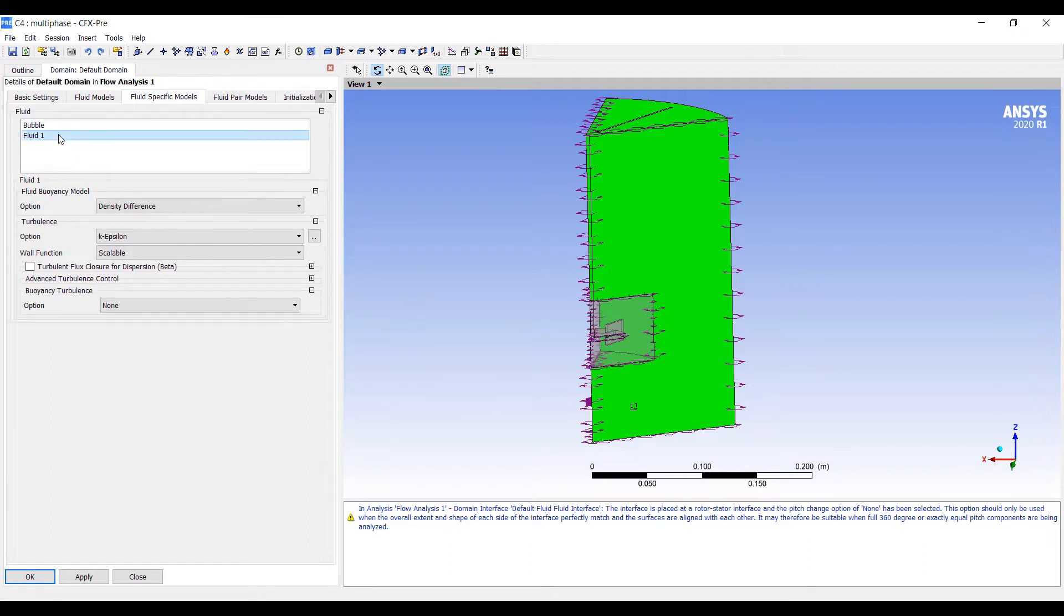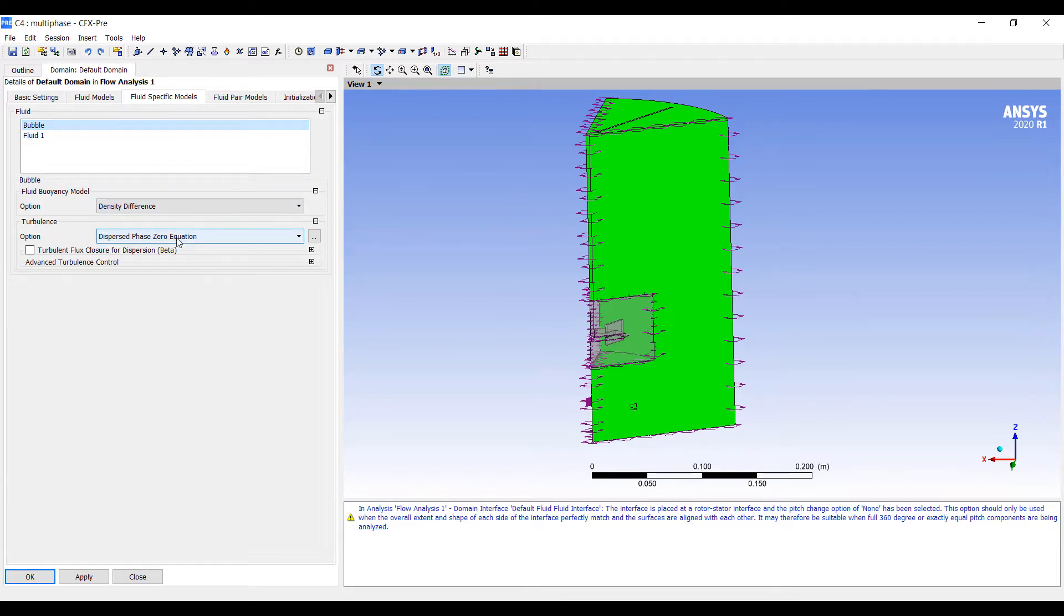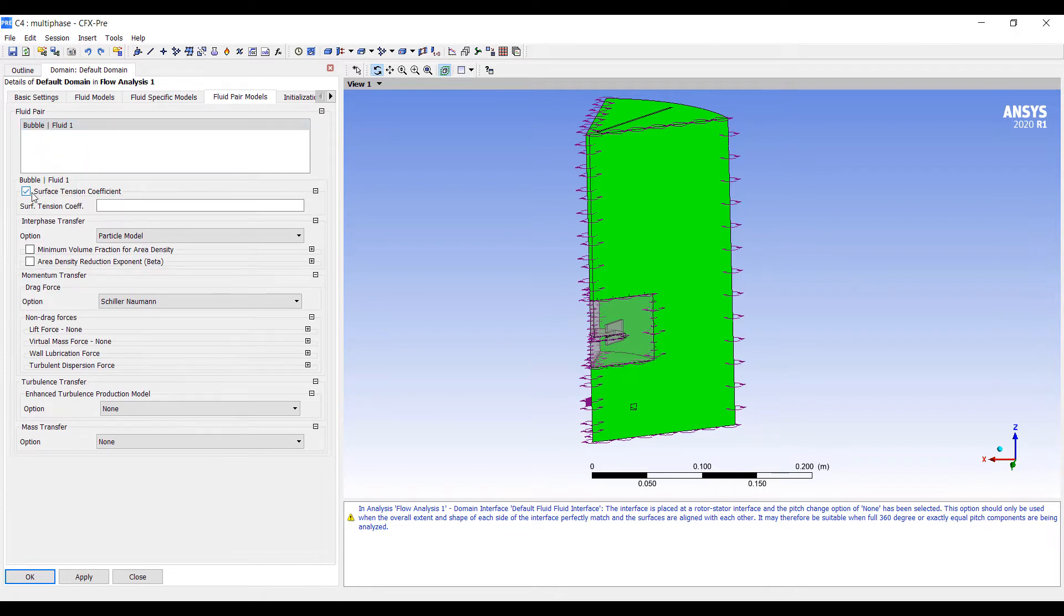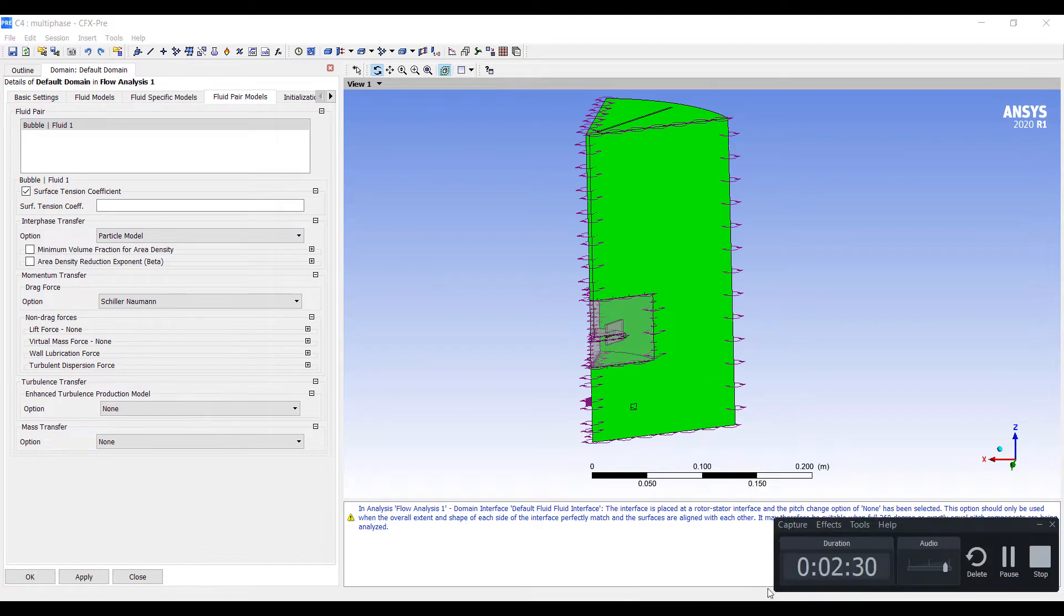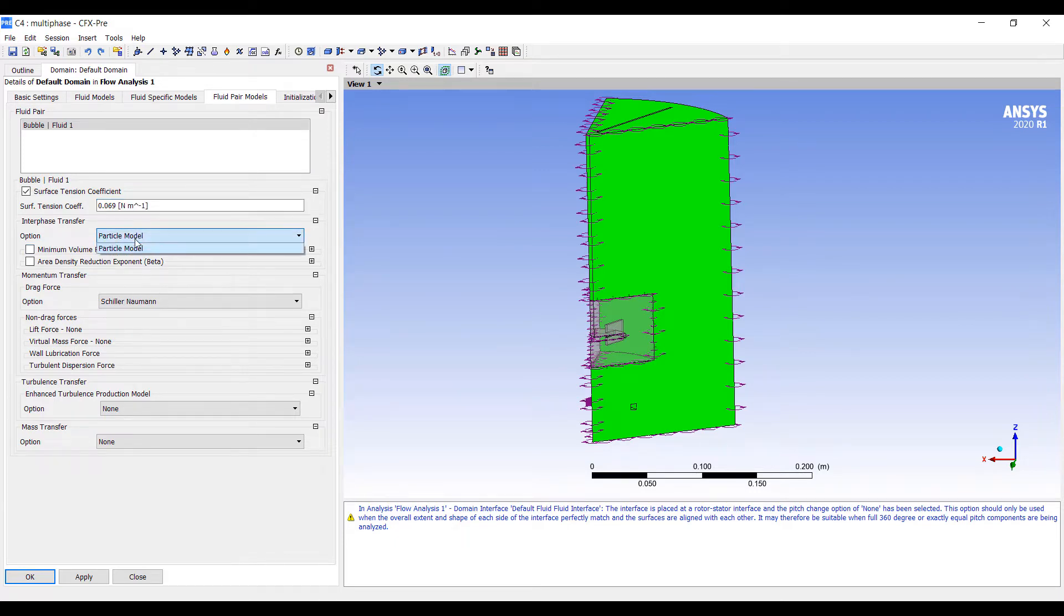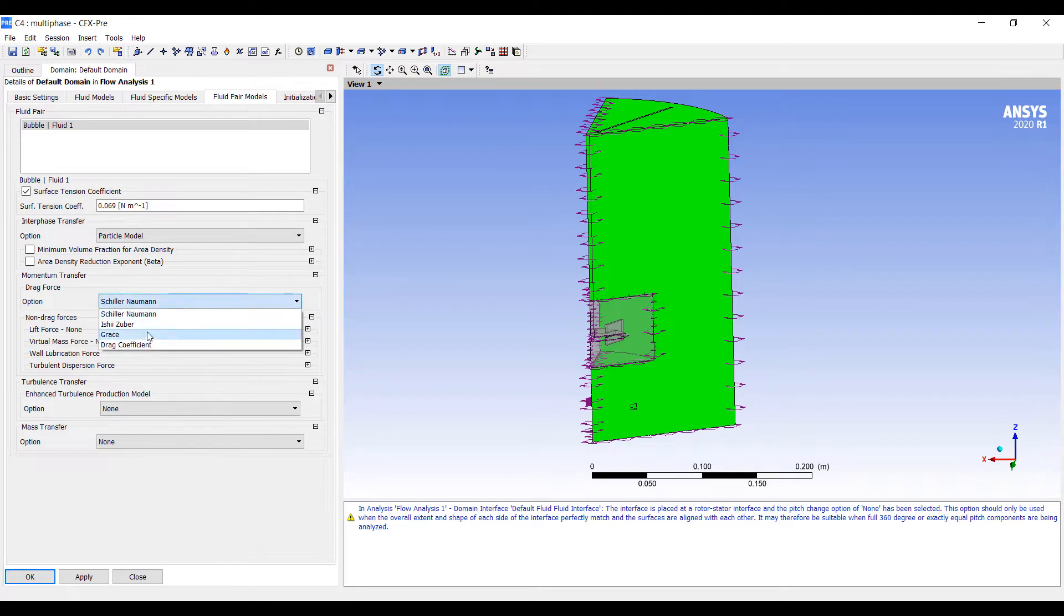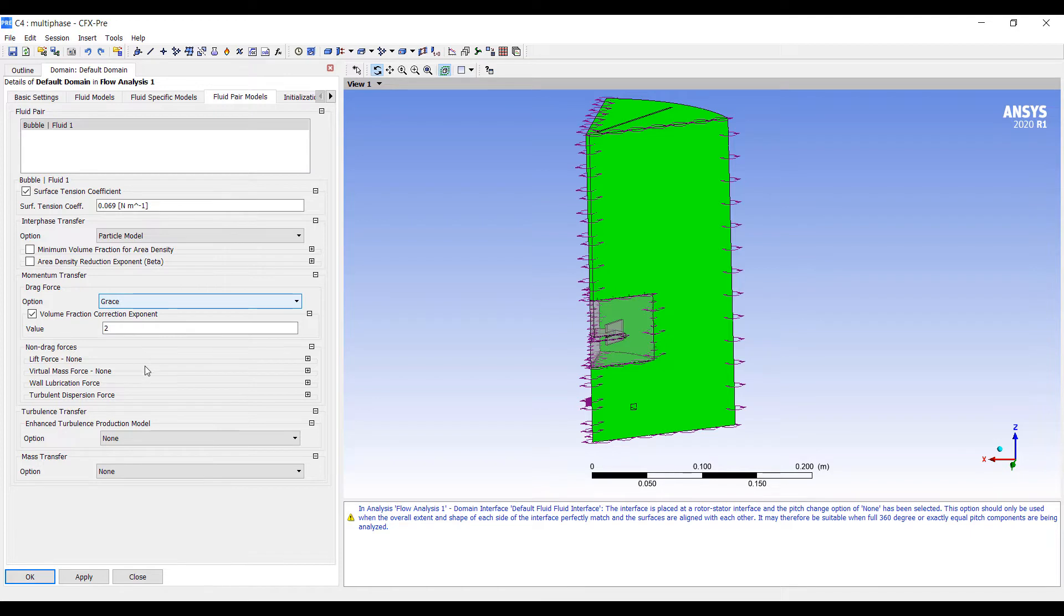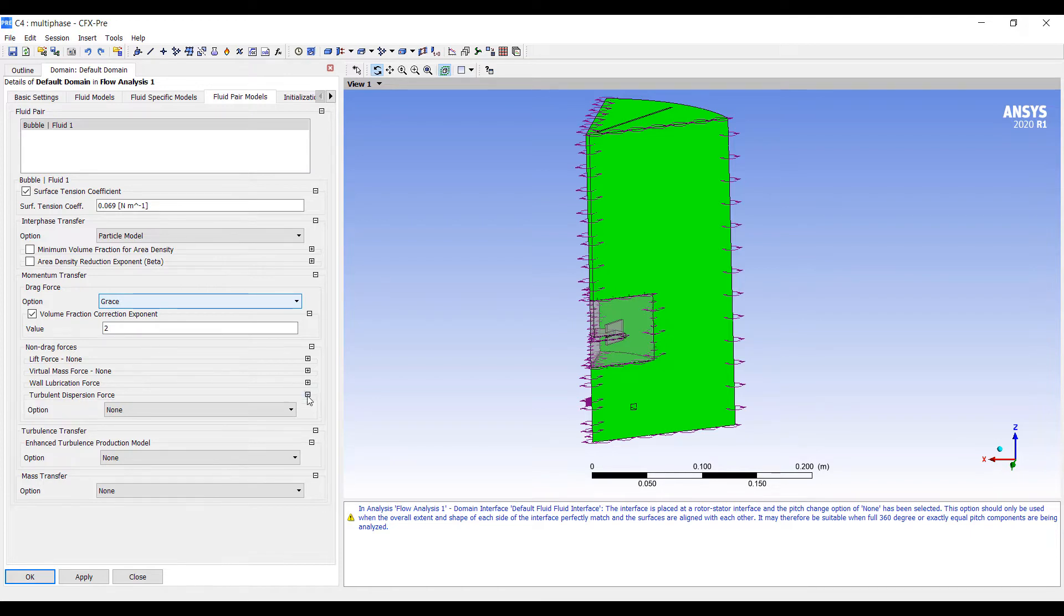Using density difference and turbulence. For particle-fluid interaction, we are going to turn on a surface tension coefficient. The surface tension is 0.069. We can turn on the interface mass transfer models later on. But for now, we're going to switch the drag model to Grace, put a volume fraction correction exponent to 2, because these bubbles are fairly large. And we're going to turn on some turbulent dispersion forces.